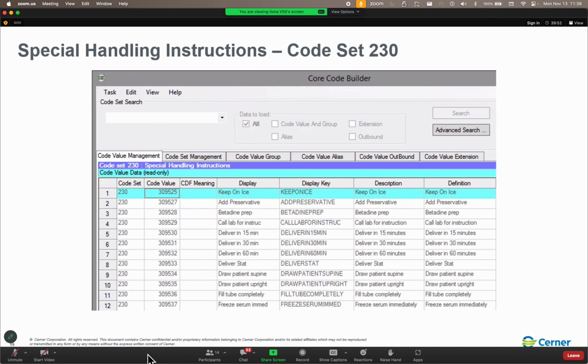And that's why we don't use the app bar in our building and maintaining classes, because we'd have to keep closing and reopening the app bar for it to pick up the new build. The application links in Bedrock don't cache data. So if you're building out lab, even a Gen Lab order, you could be going into half a dozen different applications. Being able to launch those applications from Bedrock is a really big time saver.